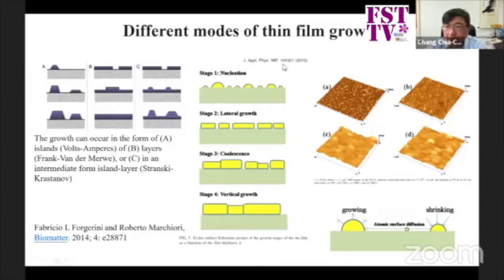In previous studies, they found that when metal granules are deposited on the substrate surface, they grow laterally and form a layer. But in fact, people found that if they sputter nano islands on the surface and leave them for a longer time, the islands migrate and form a plate.